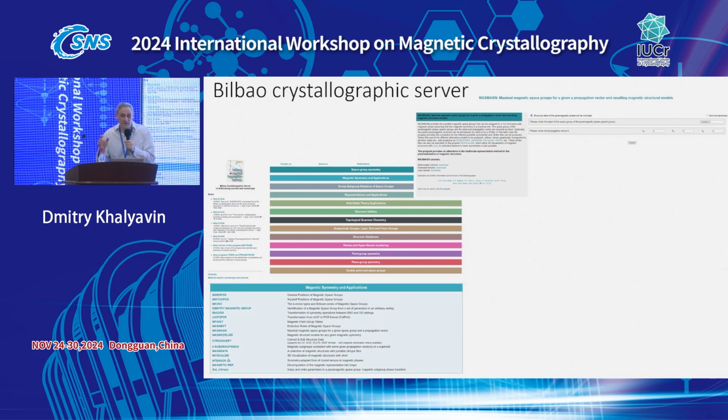And that's why a thermodynamical path to something which is not a maximum isotropy subgroup is very unusual, because usually these phenomenological coefficients are smooth functions of temperature, pressure, composition, and so on. That's why always start looking for your solution from maximum isotropy subgroups.